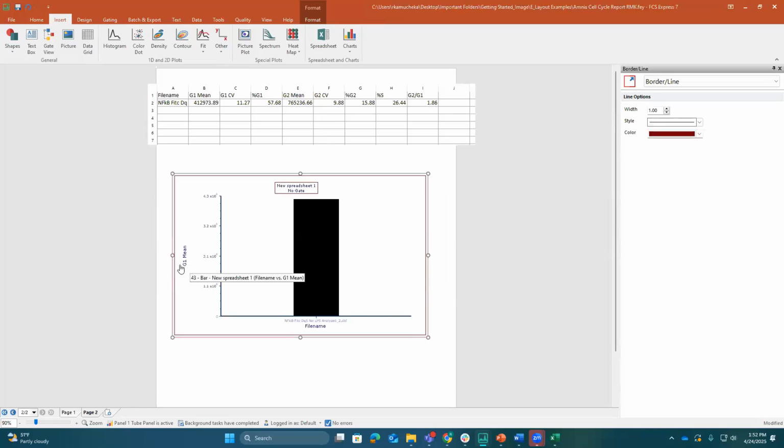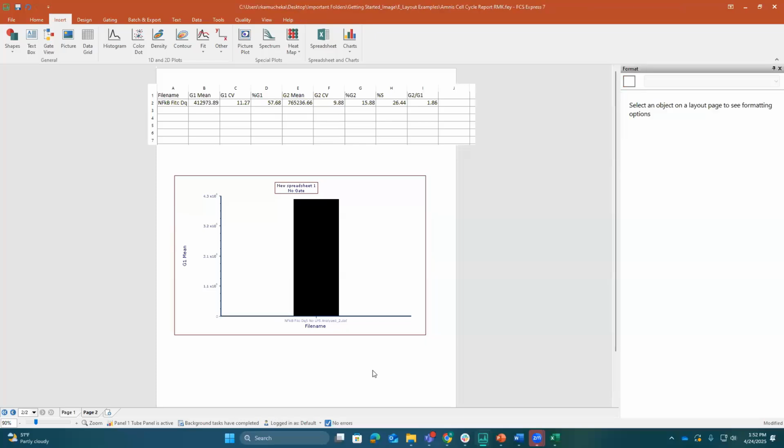We have mean, we have file name, not very significant because we're only looking at one data file right now. But if there were more events here, really quickly to introduce a bar chart, pie chart, and simply be on your way after creating these items, then you can just report them out individually as well.